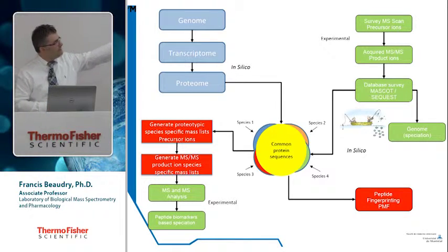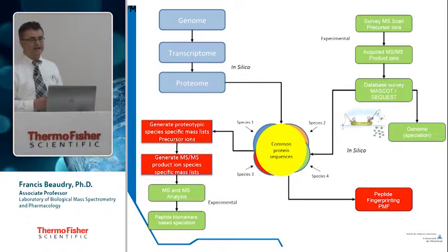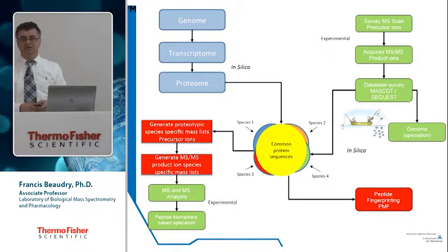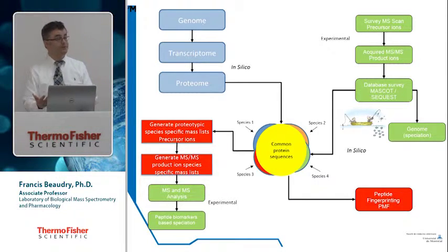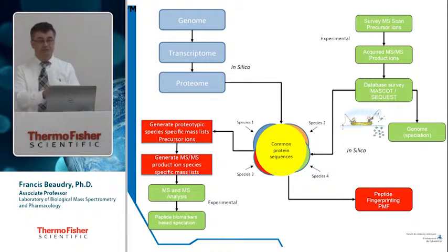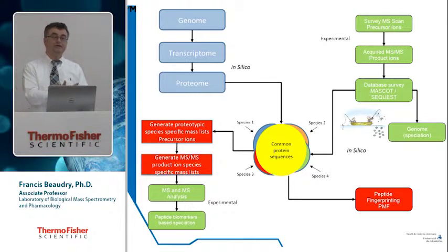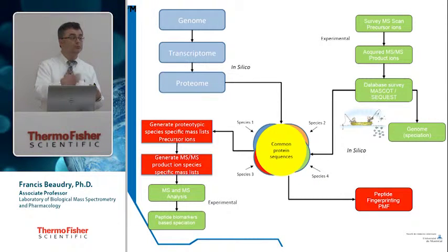By doing that, we had massive data that we compared with a database containing all the proteins. And we were using statistics to identify either, initially, a protein or a species. Basically it was done by statistics. I like to compare that to a fishing expedition, because depending on the quality of the data you have, the ion intensity, the number of hits you get is variable. It's highly variable by the user, by the technology you're using, by the quality of the sample, and in my opinion, it's not really compatible with routine analysis of a food product, or any product that you try to analyze routinely and quality control.